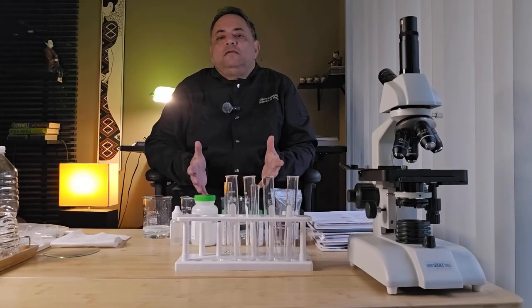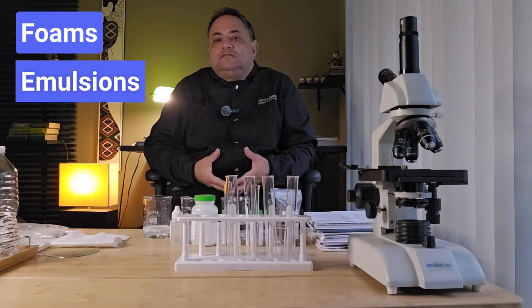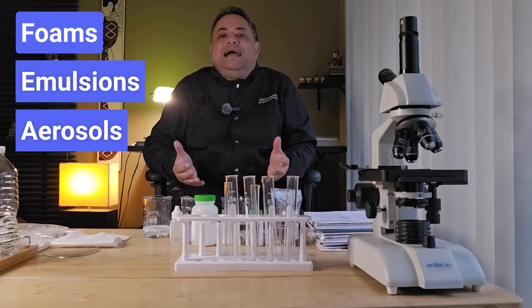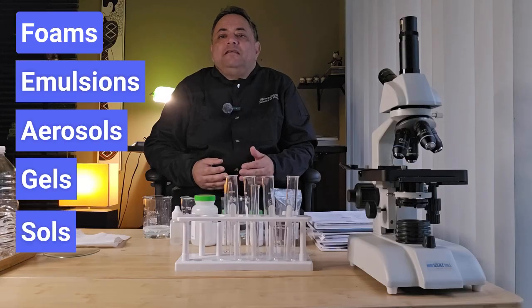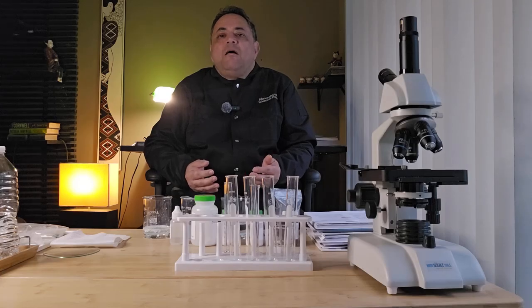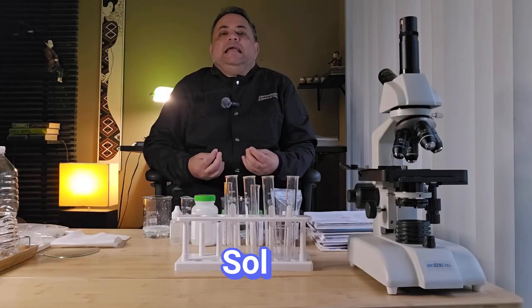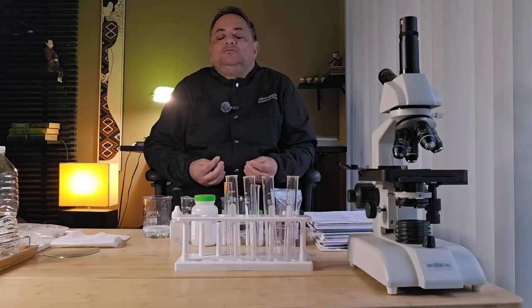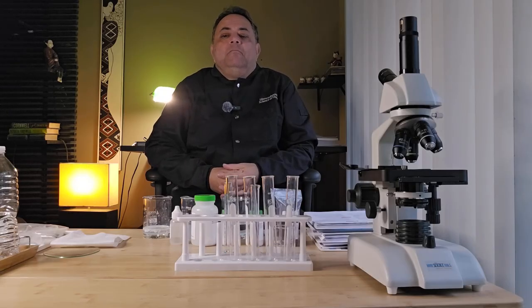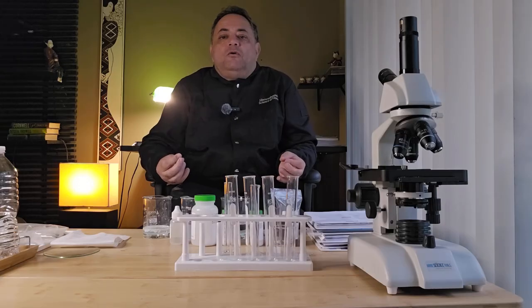A variety of colloid types exist, such as foams, emulsions, aerosols, gels, and sols. And we're going to be looking at a sol solution today and also a gel as an example of a colloid. A sol, S-O-L, is a type of colloid, a mixture in which very small particles are dispersed in a liquid medium but do not settle out upon standing. This is a typical example of a colloid.